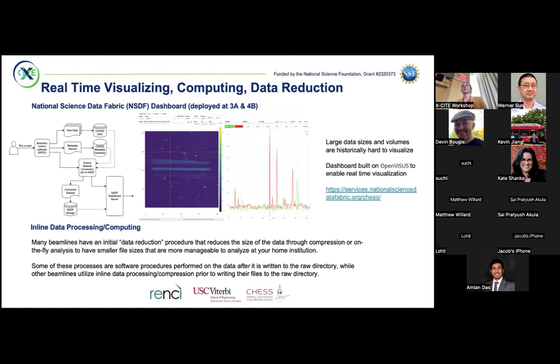It may not be obvious, but your data is so large that you may not be able to view it in conventional ways, especially if you have some of these large 2D area detectors that you're viewing. So you may need to adapt other types of strategies, or really understand that you will have to learn how to use other programs in order to view the data.